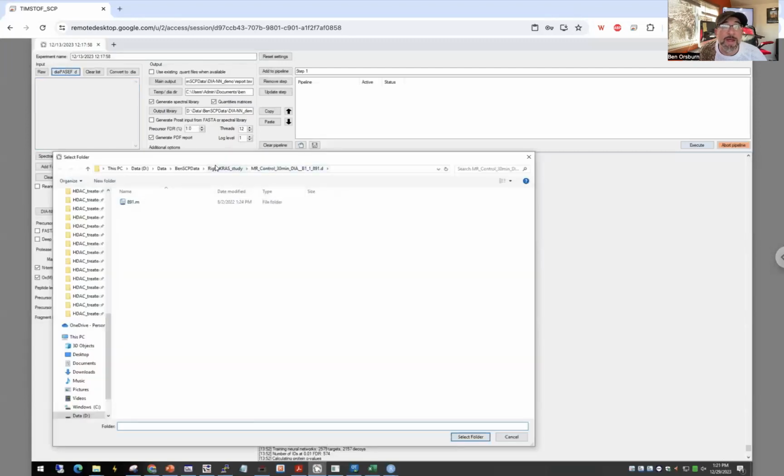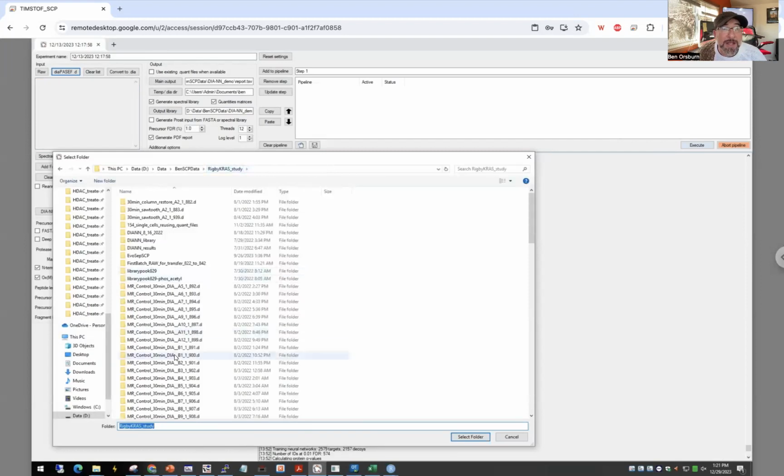I'm going to go with this, and again, I know that in this experiment, in every case, file B is 100 FACS sorted single cells, and I could tell whether that worked or not in general by the size of the file here. B1 is nearly 4 gigs. And if you look at B2, B3, which are actually single cells, these are like a gig and a half. This is pretty common when we're looking at this in DIANN. But here, I'll start with this.